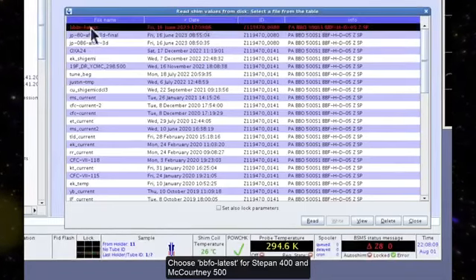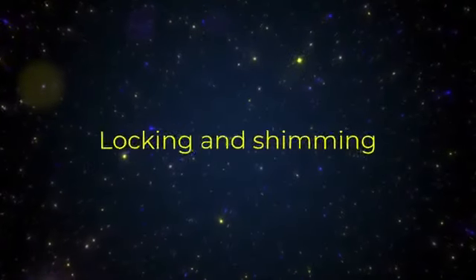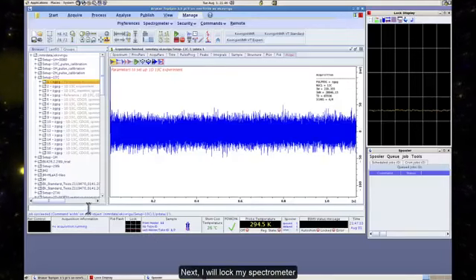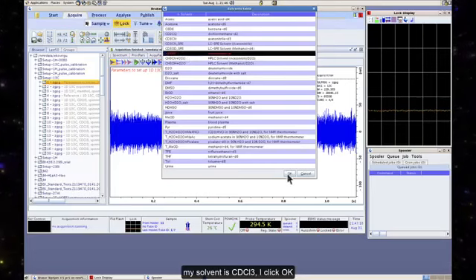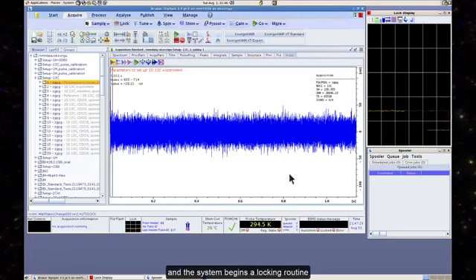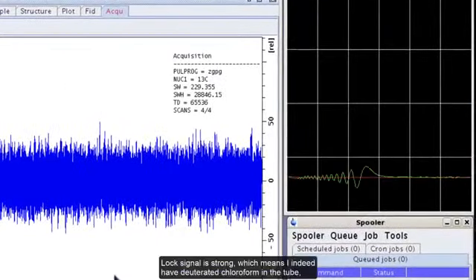increases approximately with B0^(7/4) to B0^2. 2. Increased resolution, the separation between signals, chemical shift difference in Hertz, increases linearly with B0, making overlapping peaks easier to resolve. Shim system, to ensure field homogeneity, the magnet contains a set of shim coils, Z1, Z2, X, Y, XY, etc. These are adjustable electromagnets that correct for tiny imperfections in the main magnetic field, which is critical for obtaining narrow spectral lines.